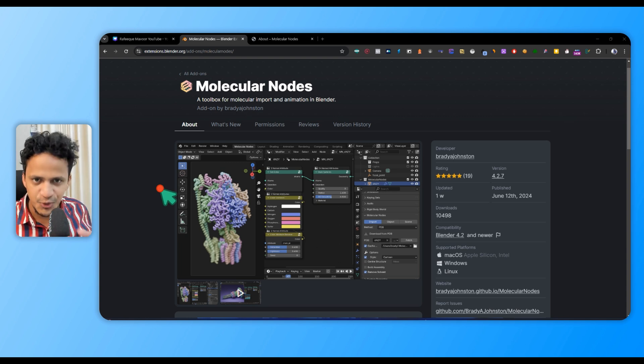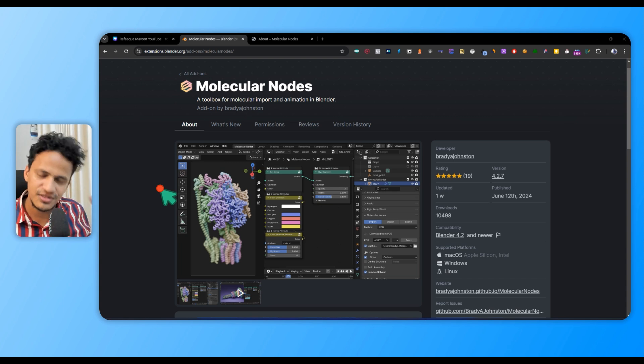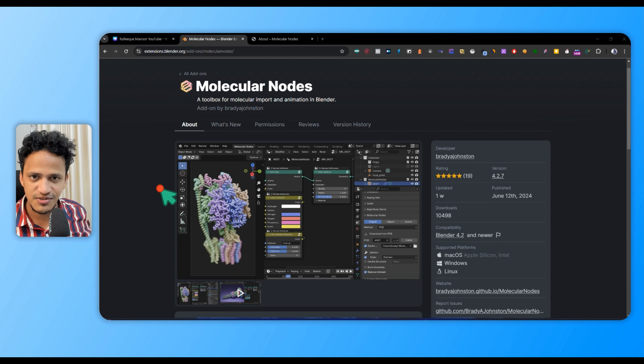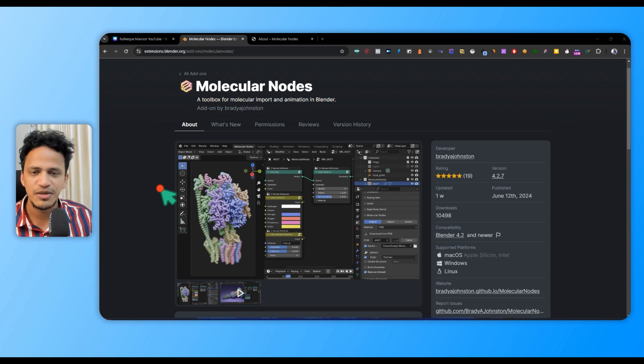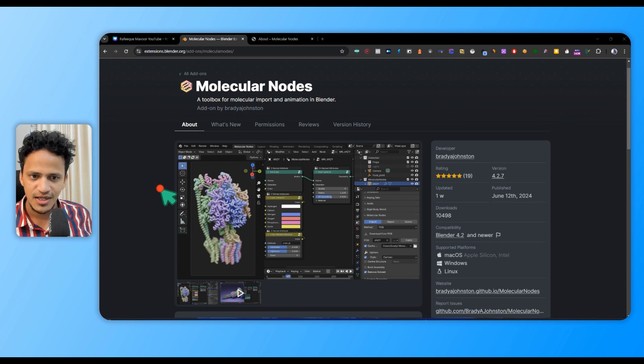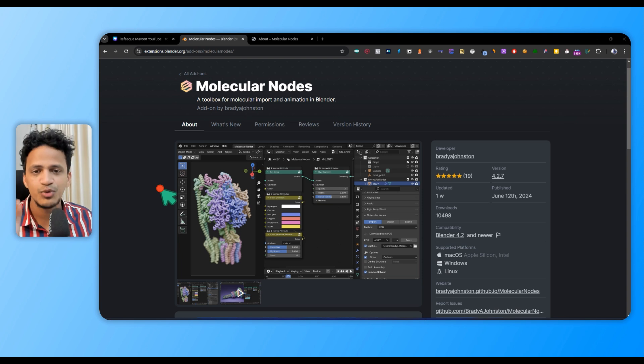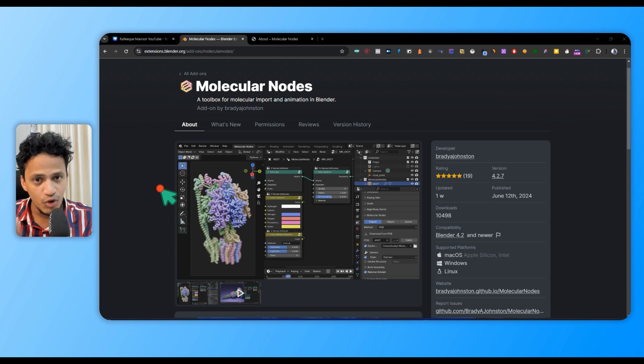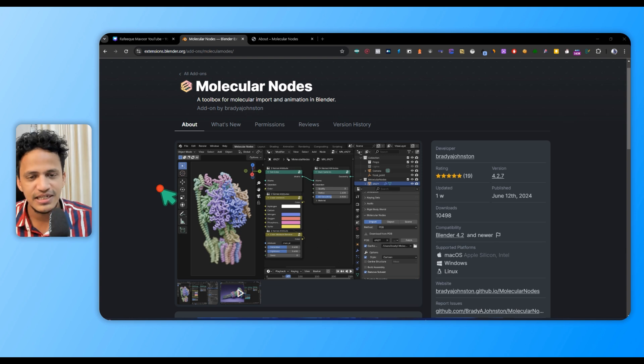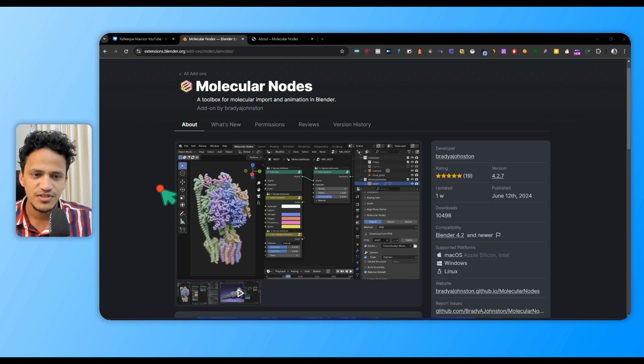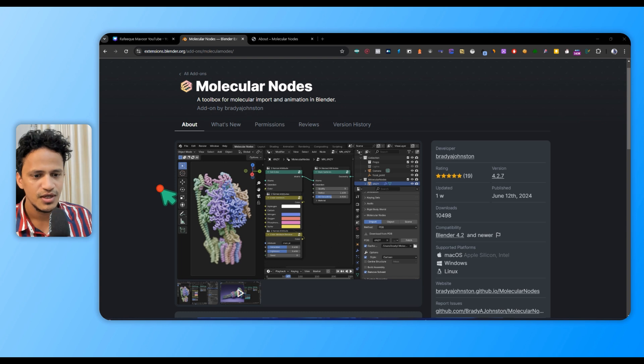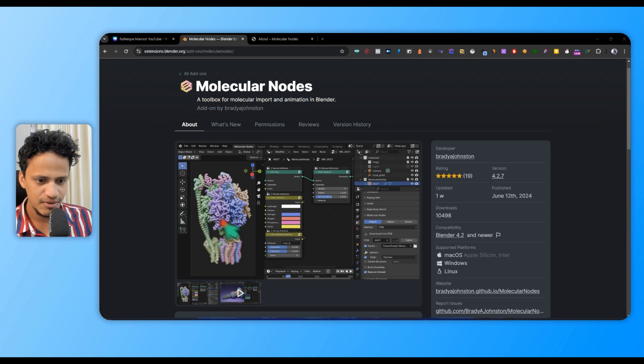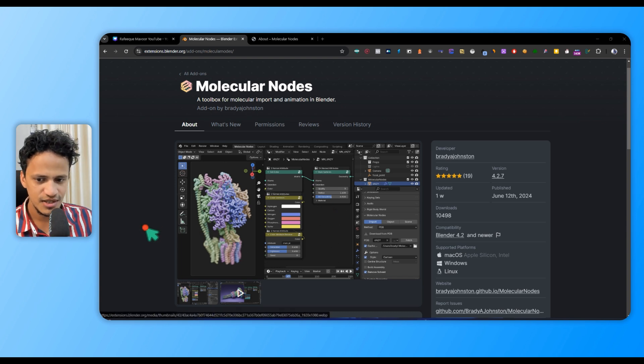This means Blender becomes a fully-fledged scientific visualization studio for structural biologists, and we can also import chemical structures. Let's learn how to install Molecular Nodes in Blender. We'll have more tutorials coming on all the details of this powerful and free add-on.